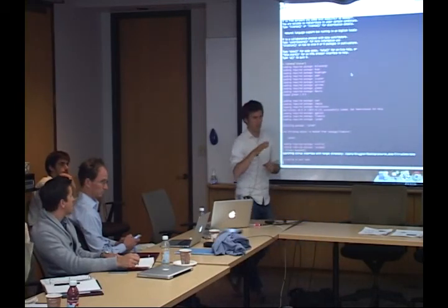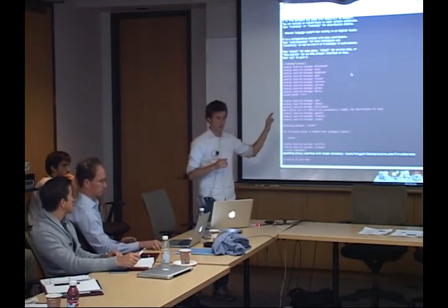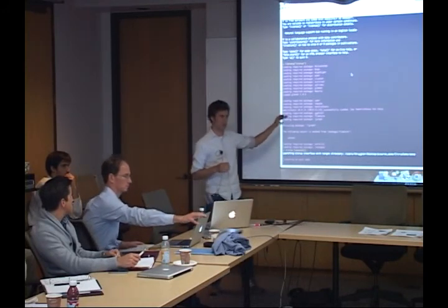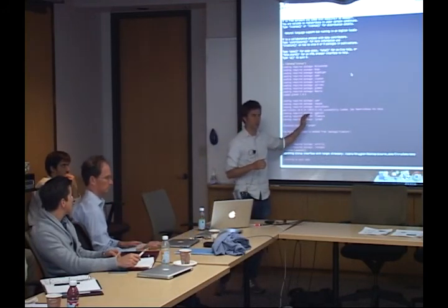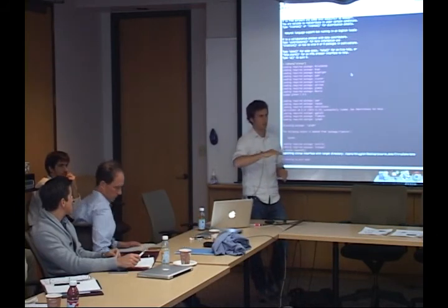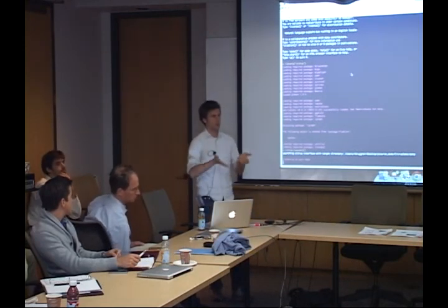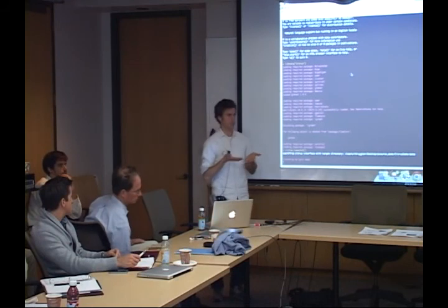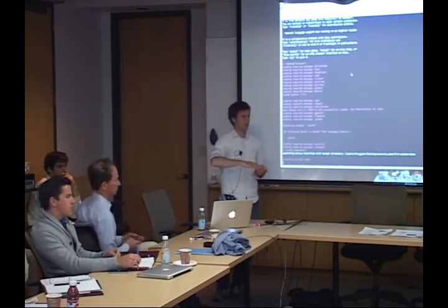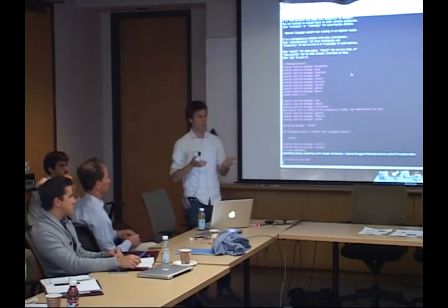Yeah, so the particular methods that this uses are non-parametric, and we don't control by p-values, we just control by false discovery rates. But yes, the list that you get out is ordered by the most significant results to the least significant results. And so you have to make the decision when you're doing this analysis that you want to be very inclusive with your results, or very restrictive, so that you have high confidence that the things you're reporting are in fact real.